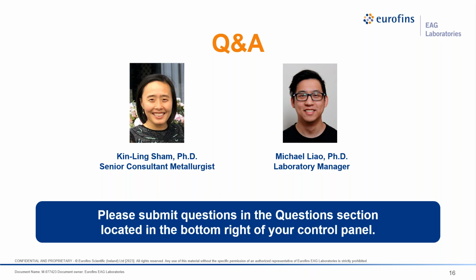Are there ways to test corrosion for vascular implants? Yes. I guess we would have to, once again, determine what the material is. If we're looking at doing general corrosion susceptibility testing, F2129 is a good way to test it. Then we would have to look at your sample size, shape, and dimension and see if there are any limitations based on the setup.